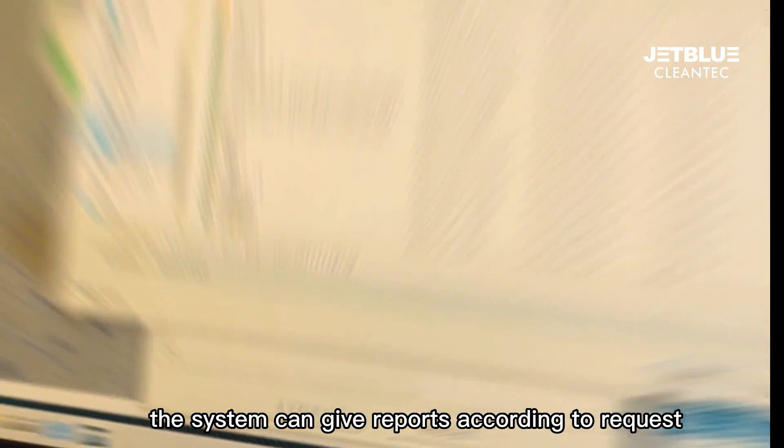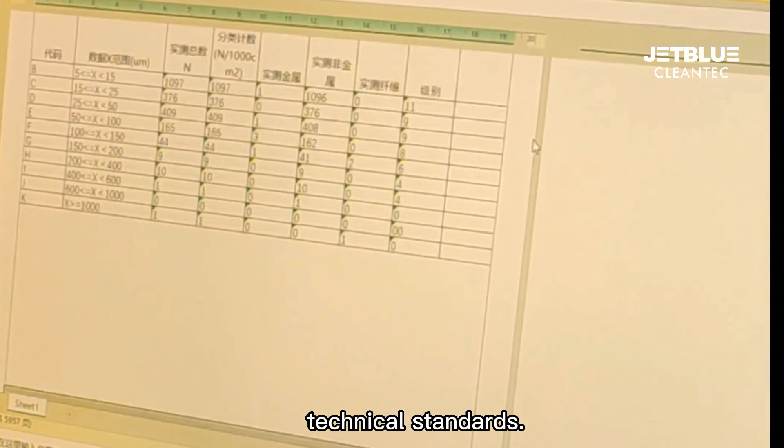After review, the system can generate reports according to the requested technical standards.